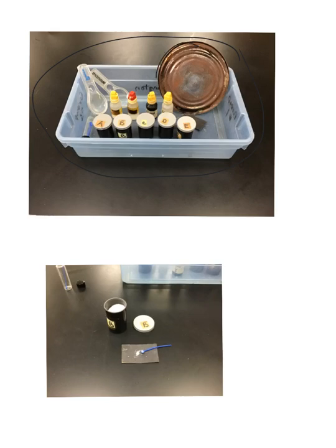You are going to have a metal can lid, which you can use to heat each of the powders to find out how it responds to thermal energy. And then you also have magnifying glasses and these black strips of poster board that you can put a very thin amount of the chemical powder onto to look for its physical properties. The last thing you're going to have are these little blue spatulas. Okay, so the blue spatula is mainly for you to not use too much powder. The number one thing I see with students is they want to use way too much. In this lab, 1 scoop, maybe 2, might be all that you need.